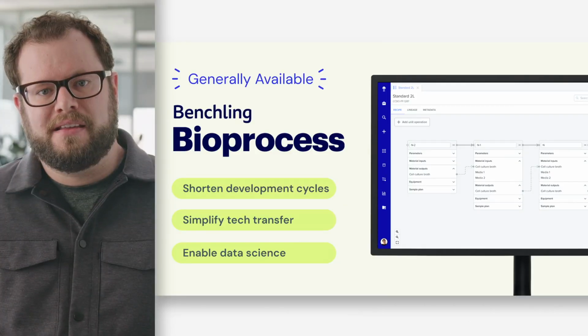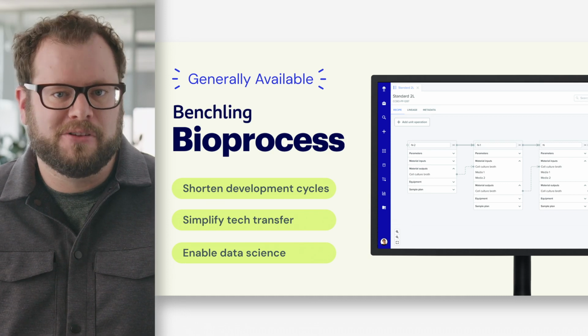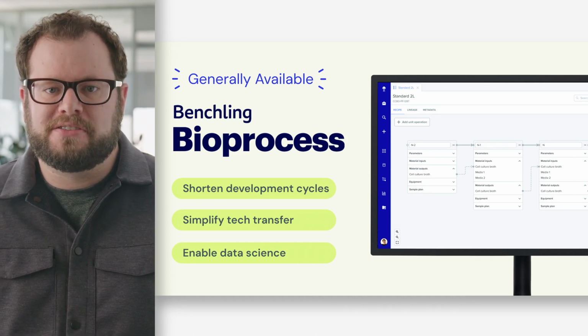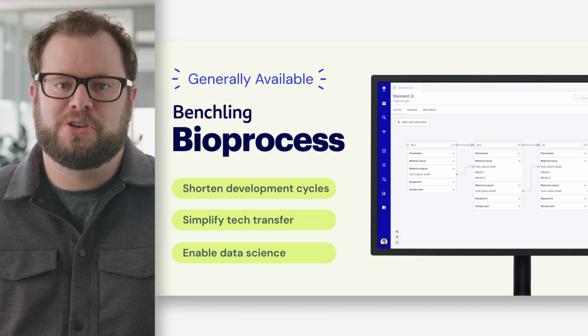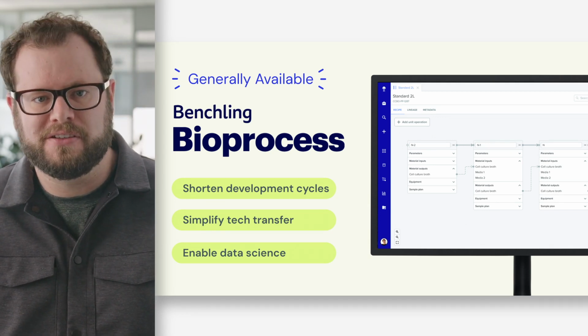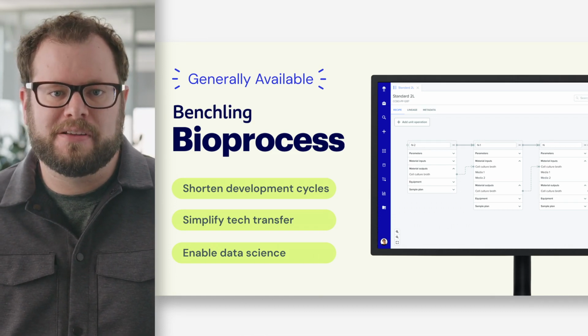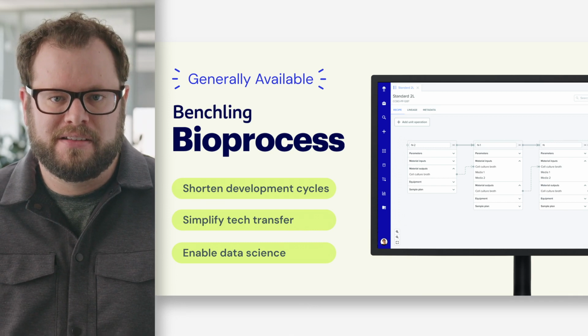These analysis tools are all available within Bioprocess, but many of our customers also take advantage of a full set of APIs in the product to move this structured information into their data lakes and AI pipelines. As Arif mentioned, we're excited to share that Benchling Bioprocess is now generally available. Bioprocess is built on top of the Benchling platform, so process development users can collaborate with research teams around data and workflows. We will continue to invest in Bioprocess and have an exciting roadmap of enhancements planned for the product.